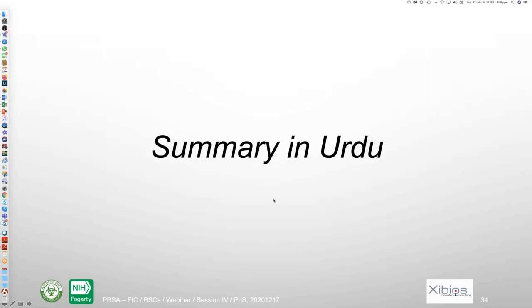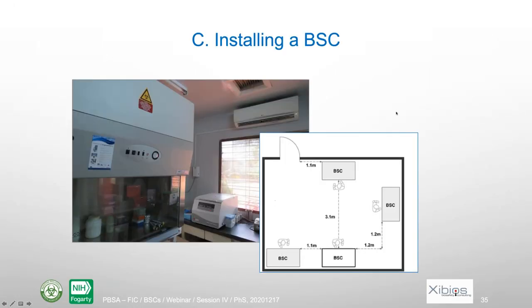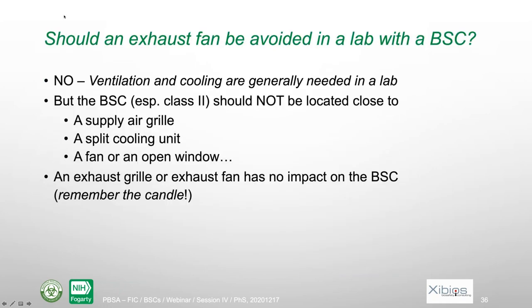Thank you very much, Furqan. So this is the last session. I'm sorry that we are a little bit late. So again, I will try to speed up on some of the slides, but I will take the time to explain the main ones. The first part is on installing the biosafety cabinet.